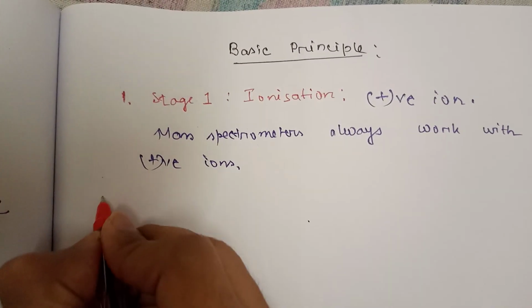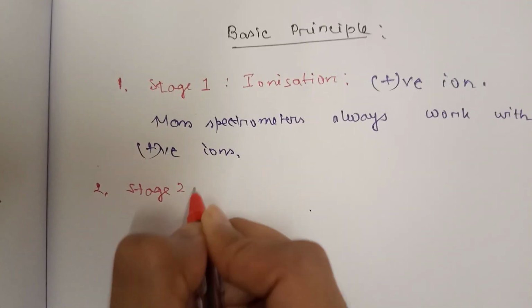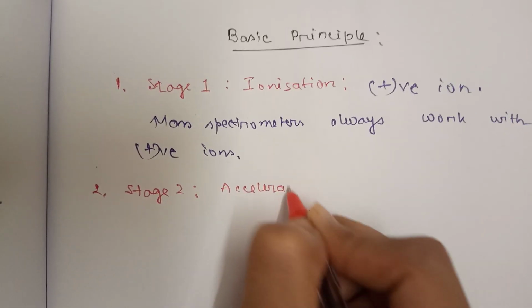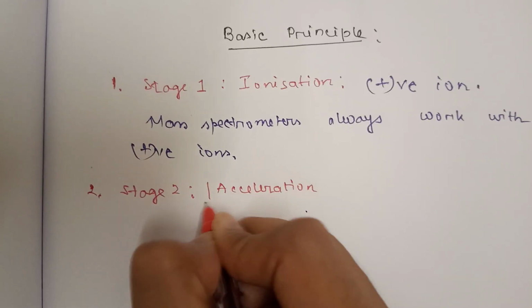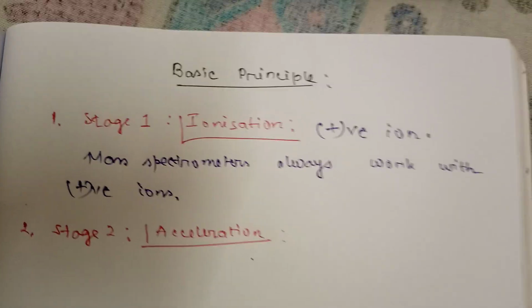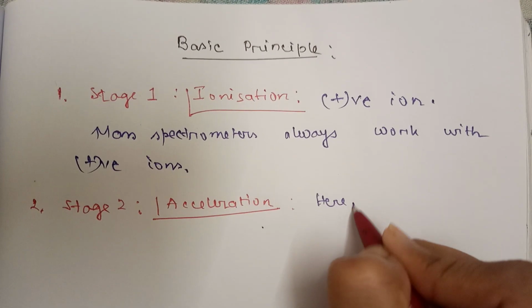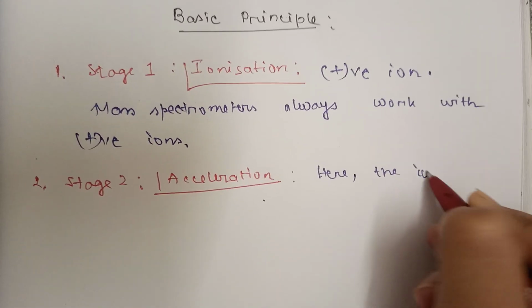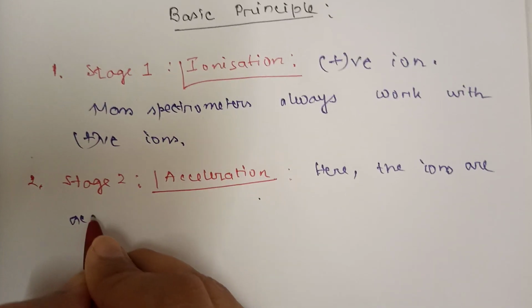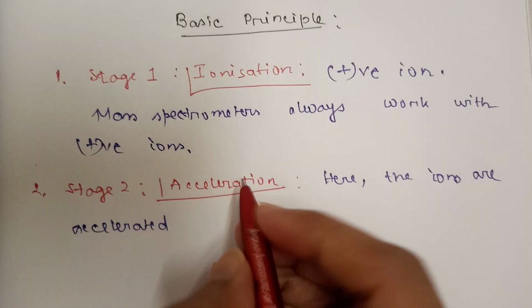The second stage is acceleration. What is that? Here the ions are accelerated, as its name suggests.